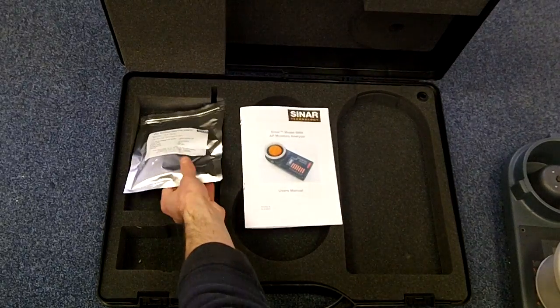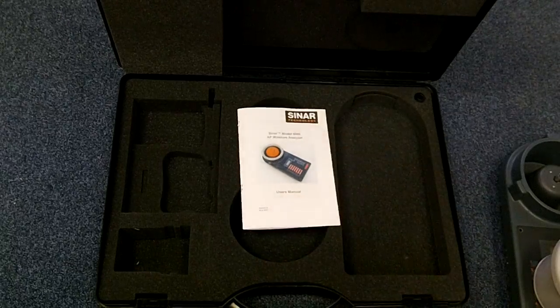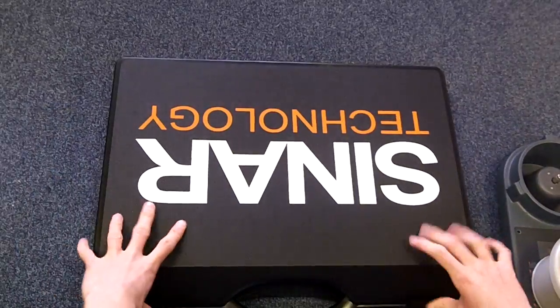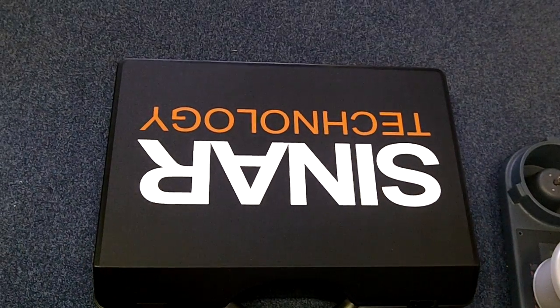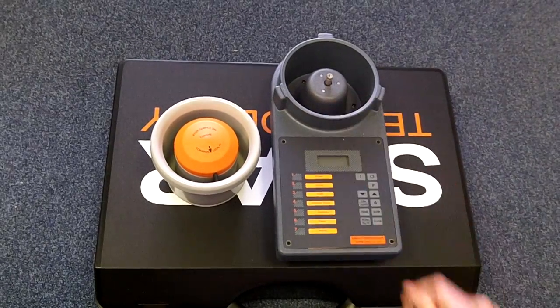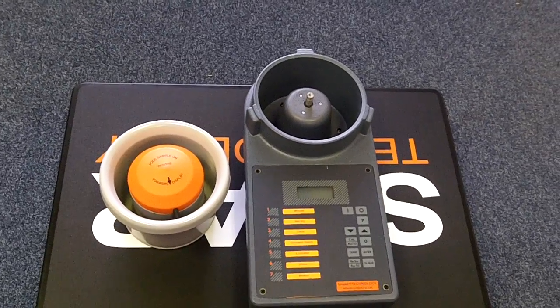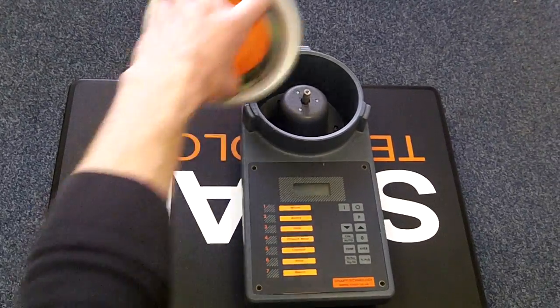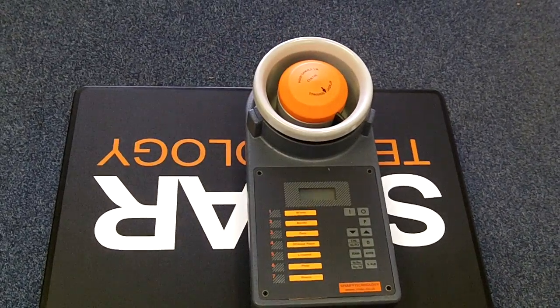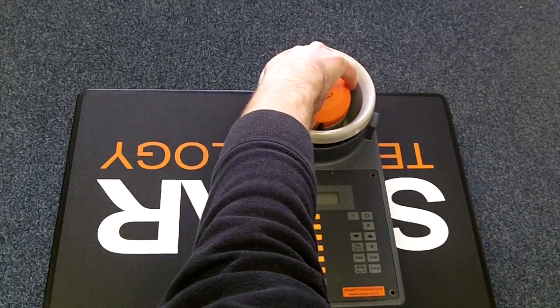You use a manual and calibration sample to check that the instrument arrived safely. Before first use it's recommended that you check your instrument with the calibration sample. To do this place the sample cell on top of the instrument at the five o'clock position, push it down gently and then turn it so the arrow faces towards you.